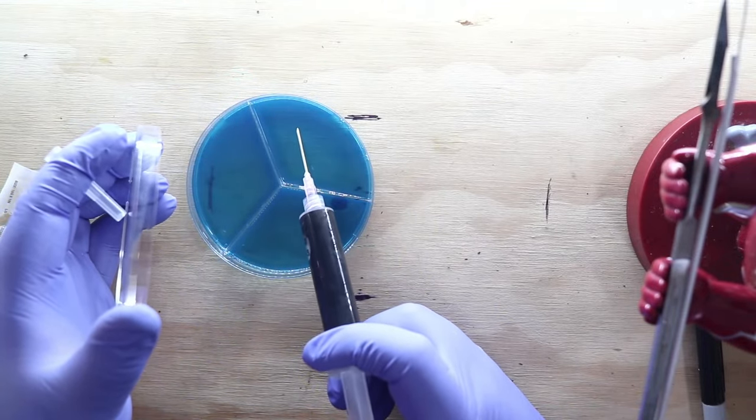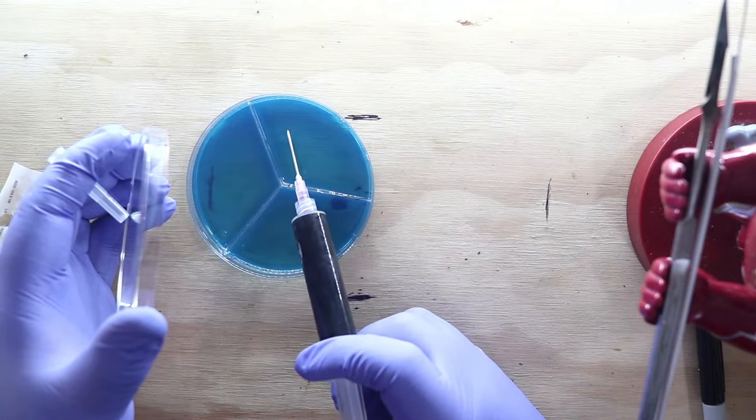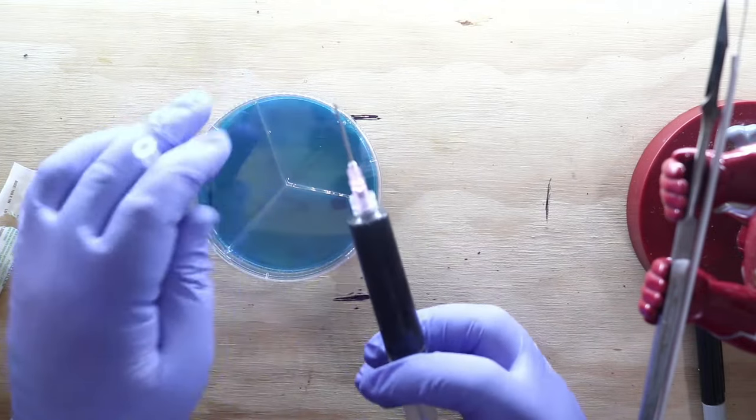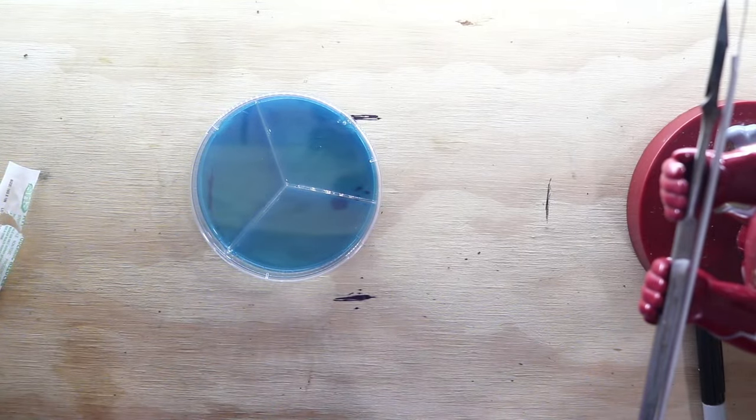Basically, when you do a liquid culture test... Oh my gosh. You have to take the needle off? There is water squeezing out, but look at that. None of that's green. I'm going to have to take the needle off. Don't stab yourself like I did.